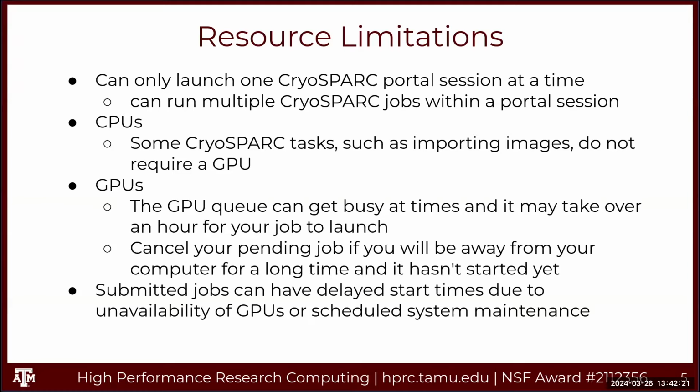The GPU nodes do get busy at times, and it might take an hour or more for your job to start. In that case, if you're going to be away from your computer and your job hasn't started yet, then it would be good to just cancel your job. Because if you go home and your job starts right at midnight and runs for 8 hours before you get back to the office, then those resources have been tied up for 8 hours without being used. And if you submit a job, it may be delayed due to an upcoming maintenance, and I'll show you how to recognize when a maintenance is scheduled.